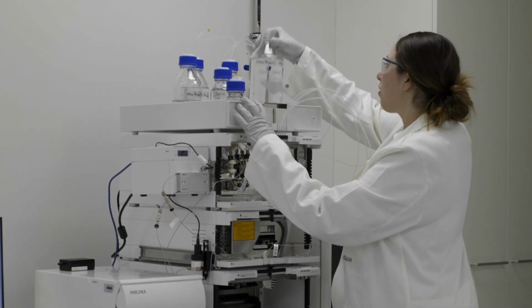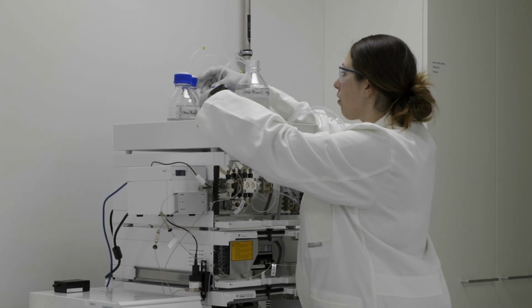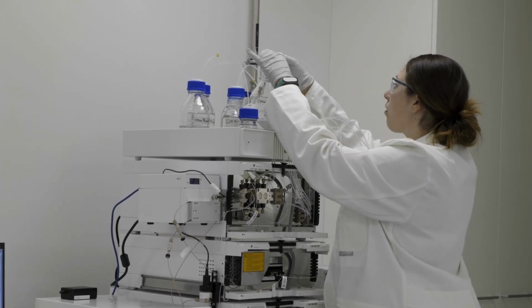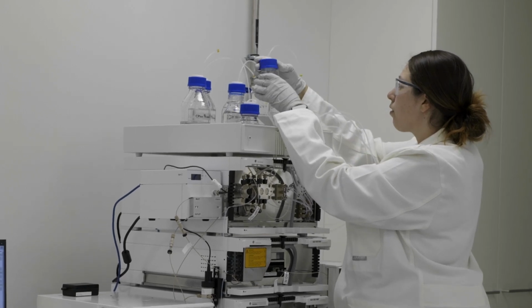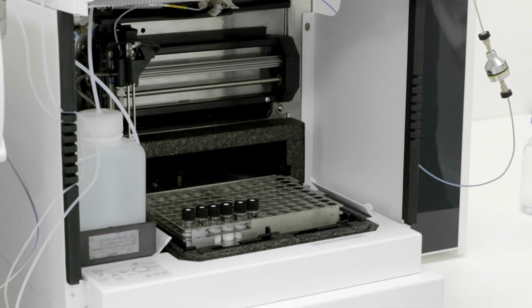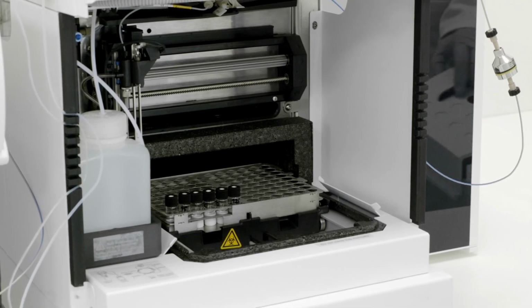To prepare for IVT monitoring analysis with PATfix, first we need to connect the buffers and the column to the system. After flushing the system with buffers, we run at least 3 blanks to ensure that the baseline is stable. Next, we inject the system suitability test sample to check the column conditions.